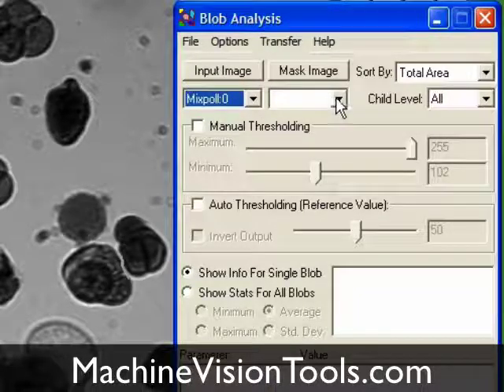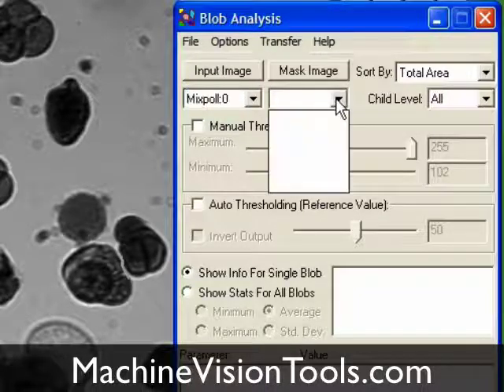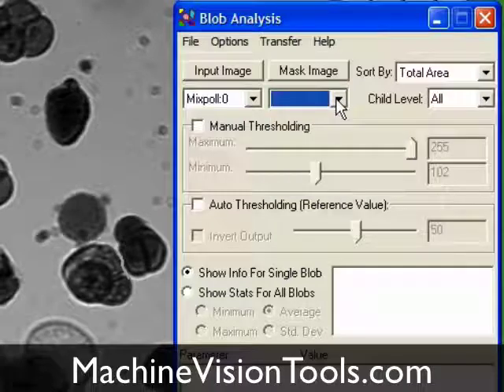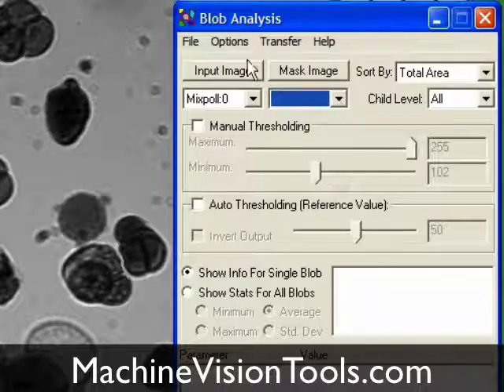The Blob Analysis Tool gives you the option of selecting a mask image to use to find blobs, or to create a mask image automatically during the blob finding operation. That's what we want to do, so we'll leave the output image empty.